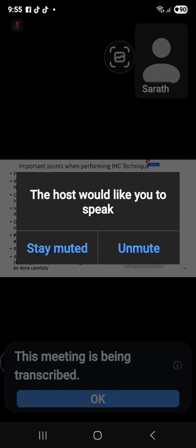I discussed in the previous presentation that should be applied here also, how to dispose of xylene and formalin. So if somebody asks how you dispose of the carcinogens, how do you dispose of the chemicals in the IHC, that is the answer. You have to tell about the DAB carefully. DAB should be carefully put into the disposal without inhaling, without handling. When you are handling, you have to take care. And the xylene and formalin I have mentioned earlier.